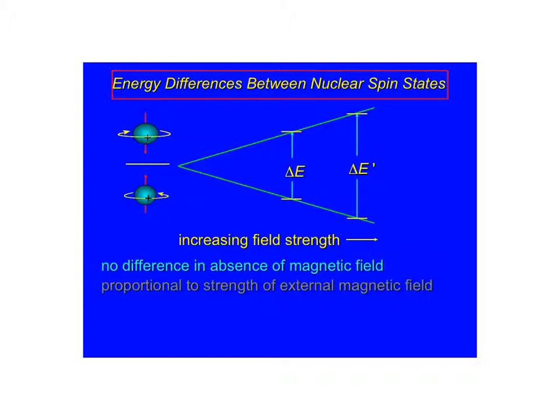So here, it's not the easiest to see, and that's not a division sign. The way this diagram shows it, this point right here is the cup without the external magnet. There's no magnet, so we just have an equal mixture of both. But as we start to put in an external magnet, at this point, if we have a magnet that's this strong, we're going to have a slight difference. Those that are against the magnet will be at that energy level, and those that are along with it will be at this energy level.